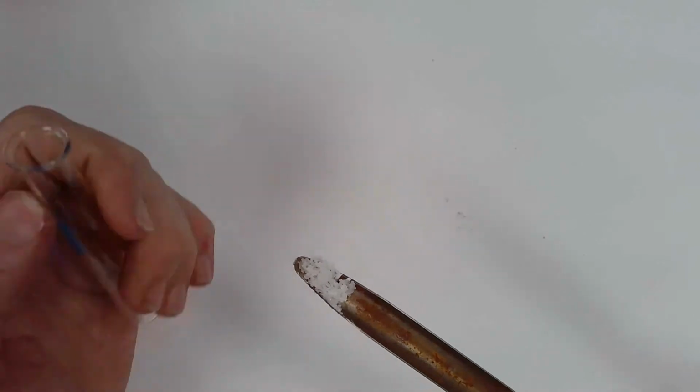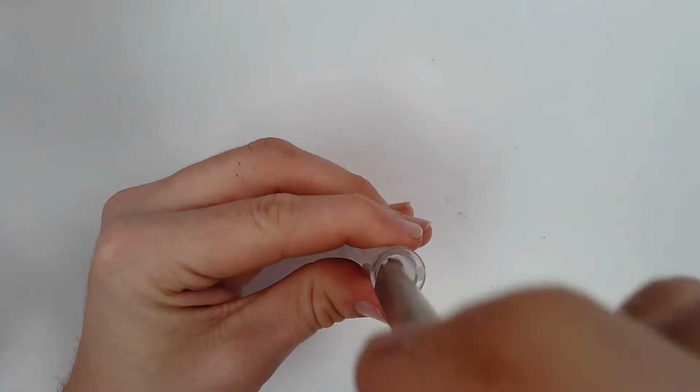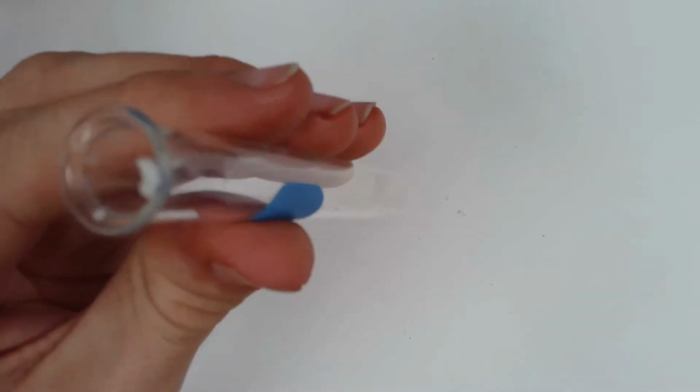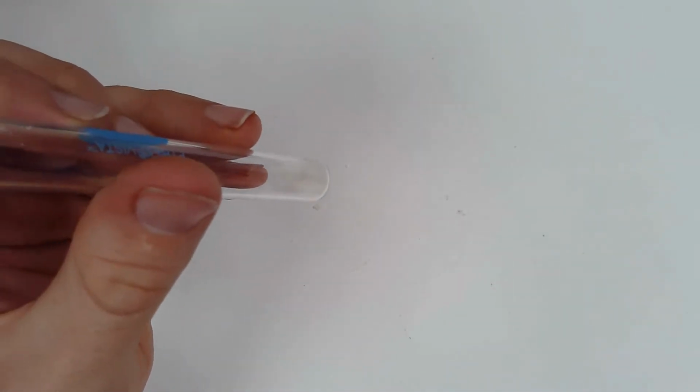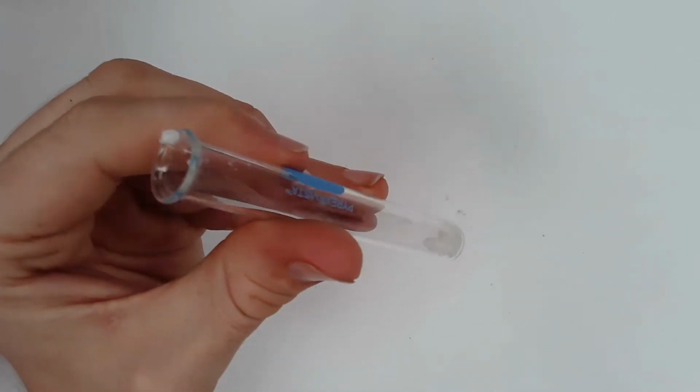All right, so I'm going to add my salt to a test tube. And you can see there's not a lot in there, right? I don't need a lot to do this lab. I just need a little bit in there. Now, that's not aqueous. So what do I need to add to the test tube to make this a solution?